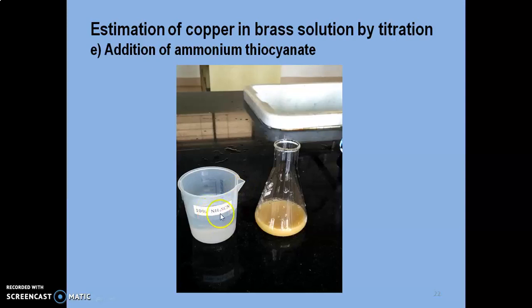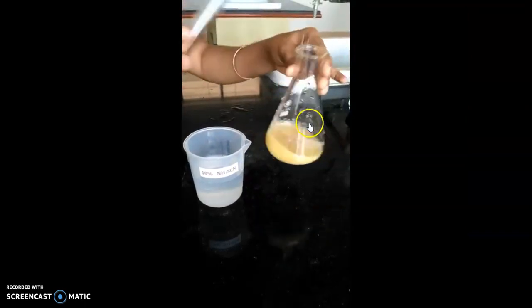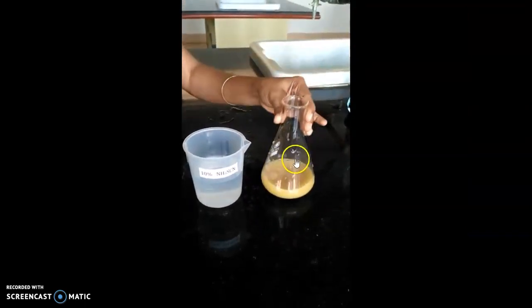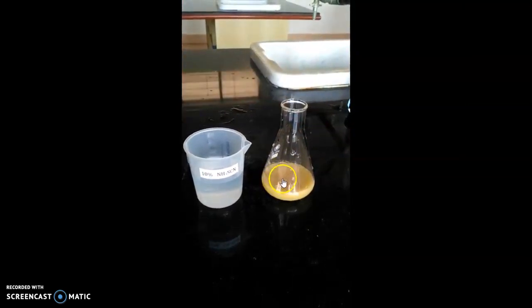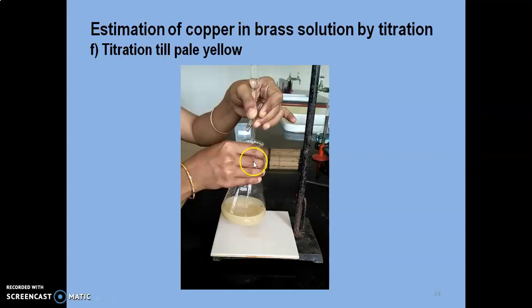Later, ammonium thiocyanate solution has to be added to it. 5 cm3 of ammonium thiocyanate is added. During that time, occluded iodine will be starting to release. Immediately, it has to be titrated with hypo solution.